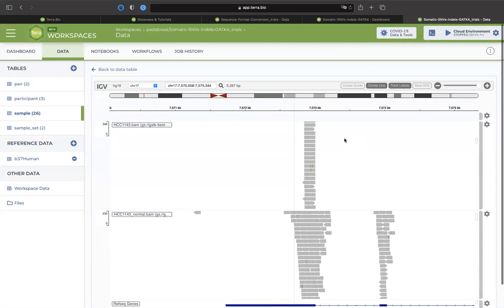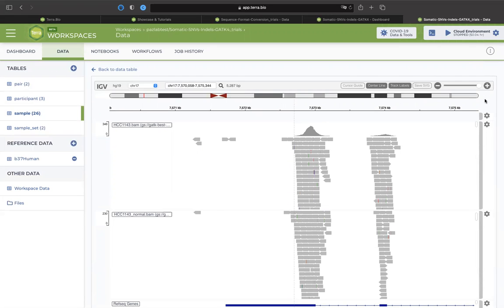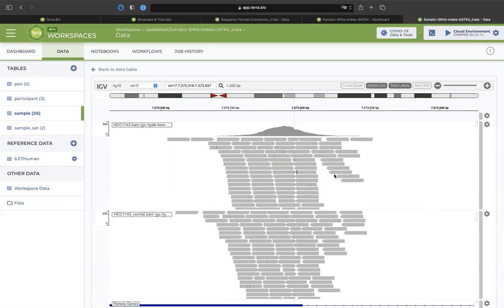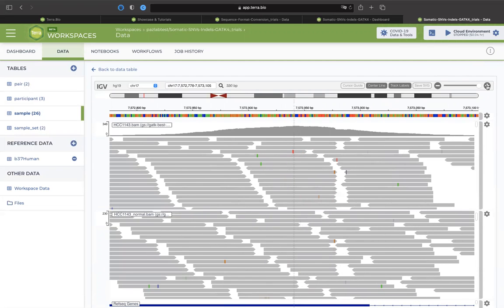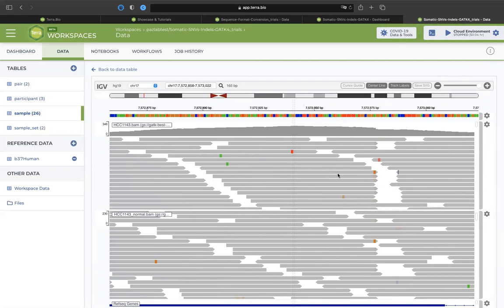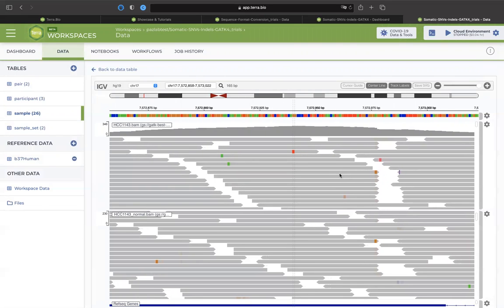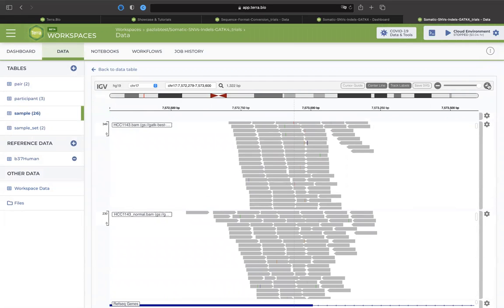Okay, now let's put the center line on something else. You could see there are some gaps here. Let's see what we could find. Let's see what it is. Let's see whether these are a common phenomenon. You can see across samples, across the reads. More likely, yeah.